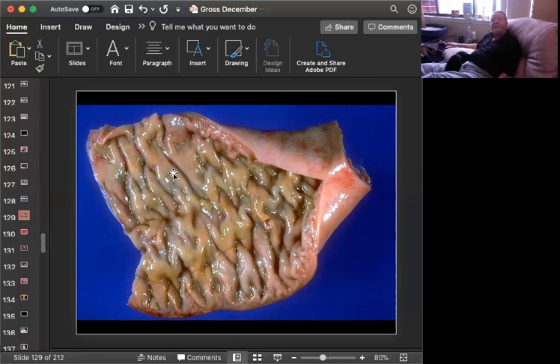Okay, time's up. We are looking at the intestine. The intestine looks somewhat swollen. Normally it's not quite as rugose as this is. And I told you that this was a foal. This is about the time of the year that it's foaling season now in Kentucky. And in the fall, we're going to see a number of foals which have this particular condition.